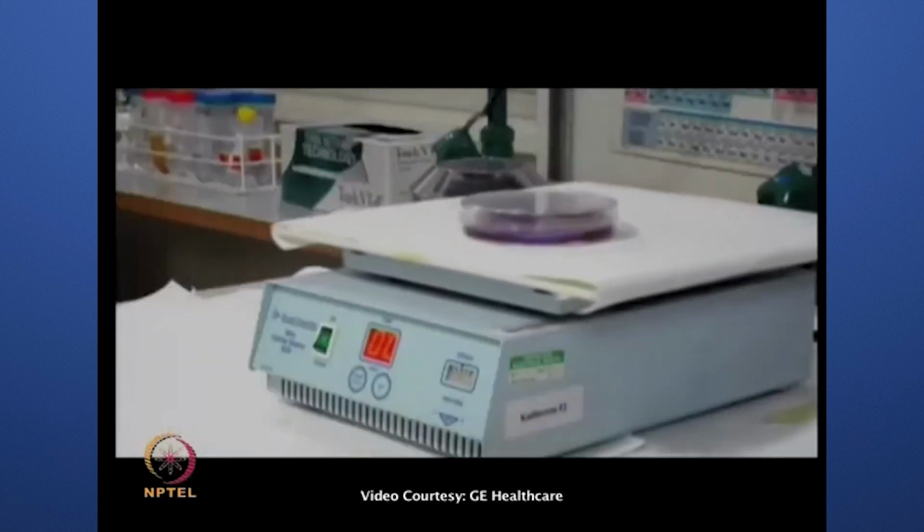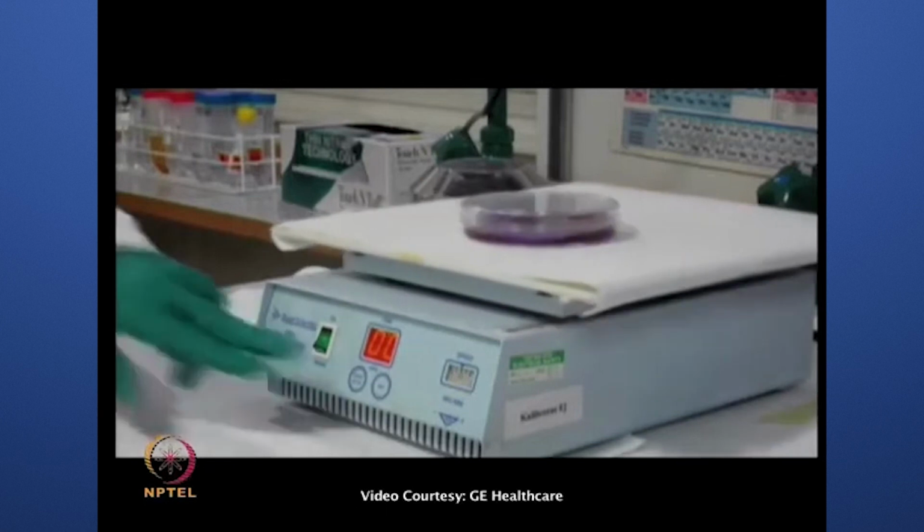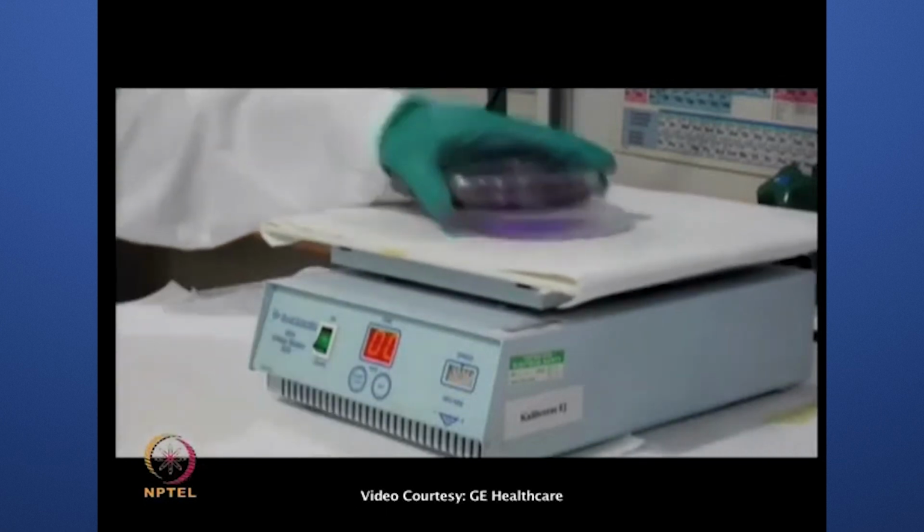After the isoelectric focusing, the strips are removed and equilibrated in SDS-containing buffer in 2 steps using DTT to reduce the disulfide bonds of cysteine residues, followed by alkylation with iodoacetamide to avoid modification by acrylamide.